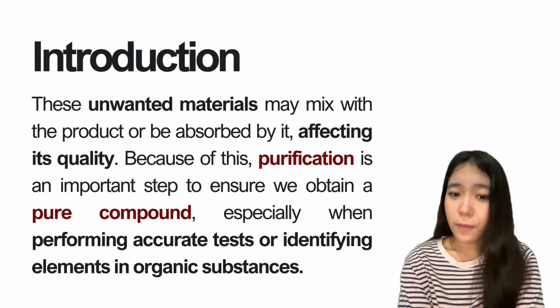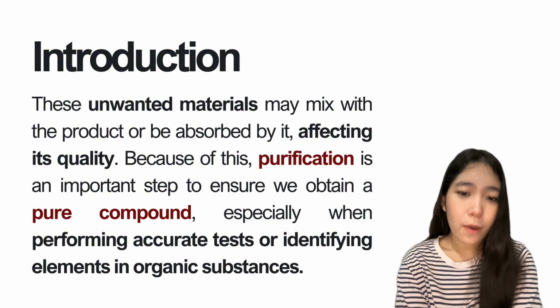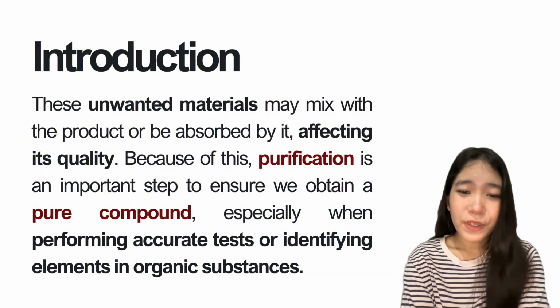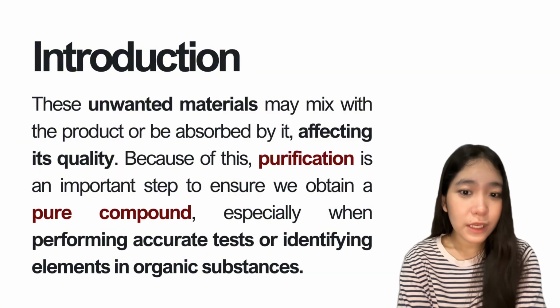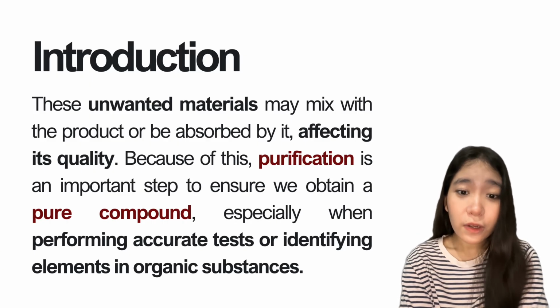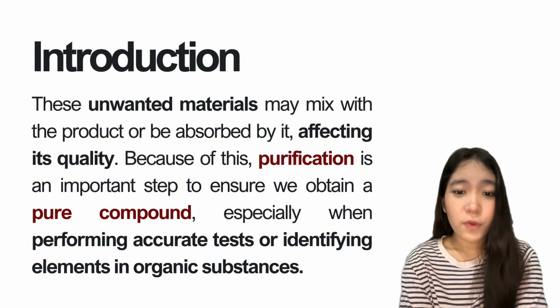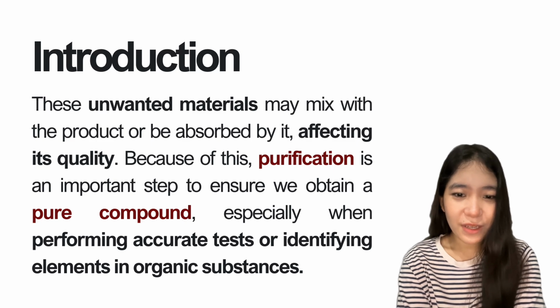So in this experiment, we have different methods of purification of organic compounds, which are mainly crystallization, distillation, extraction and chromatography, sublimation, dialysis, decolorization, and formation of addition compounds. We will talk about it one by one, but first, let's start with crystallization.